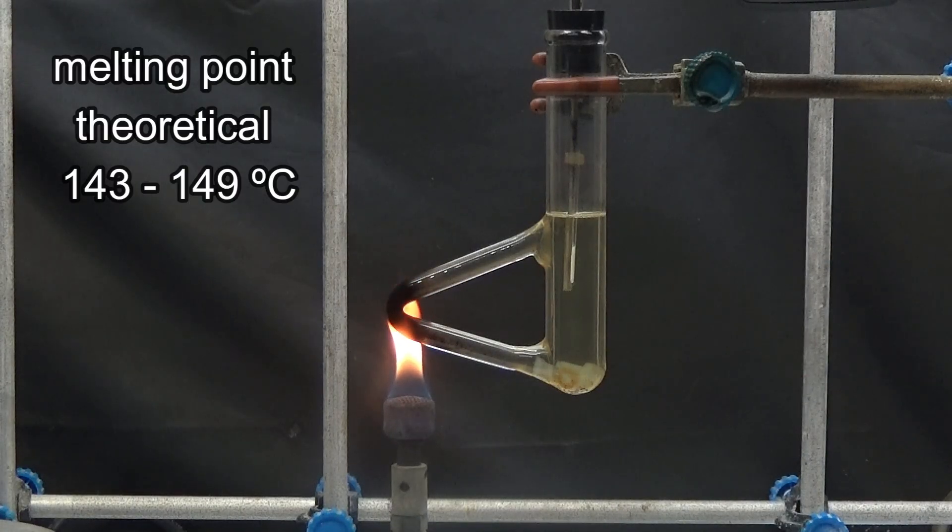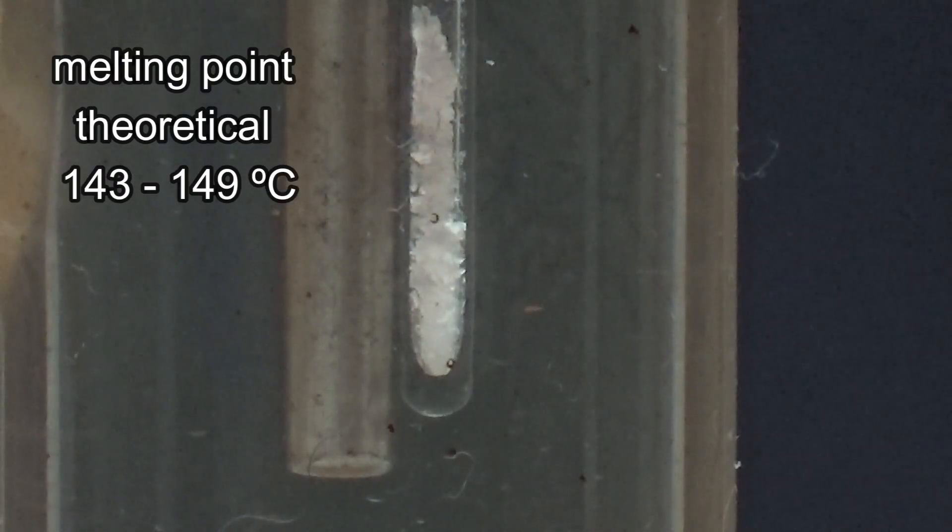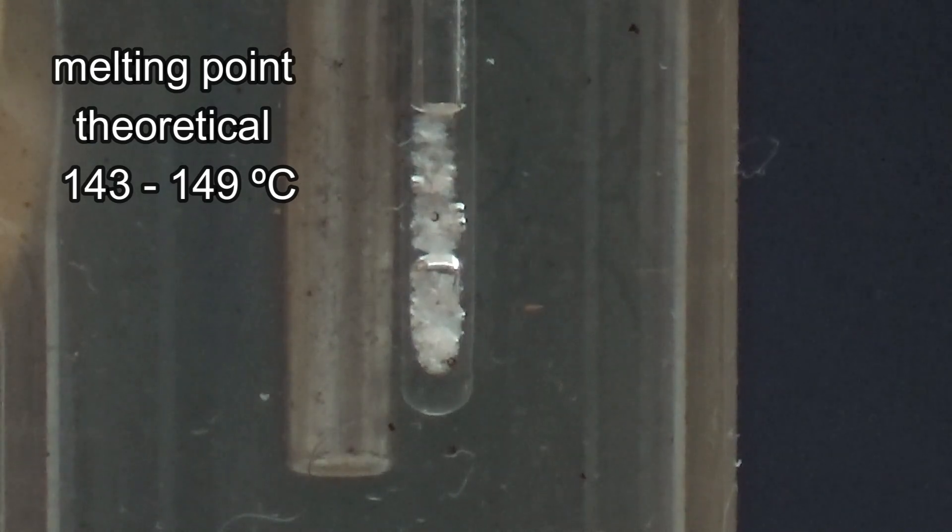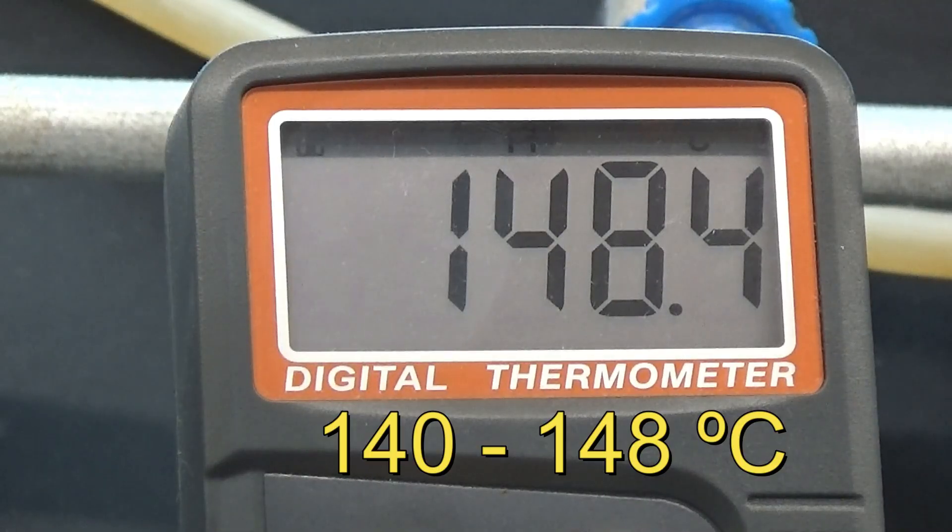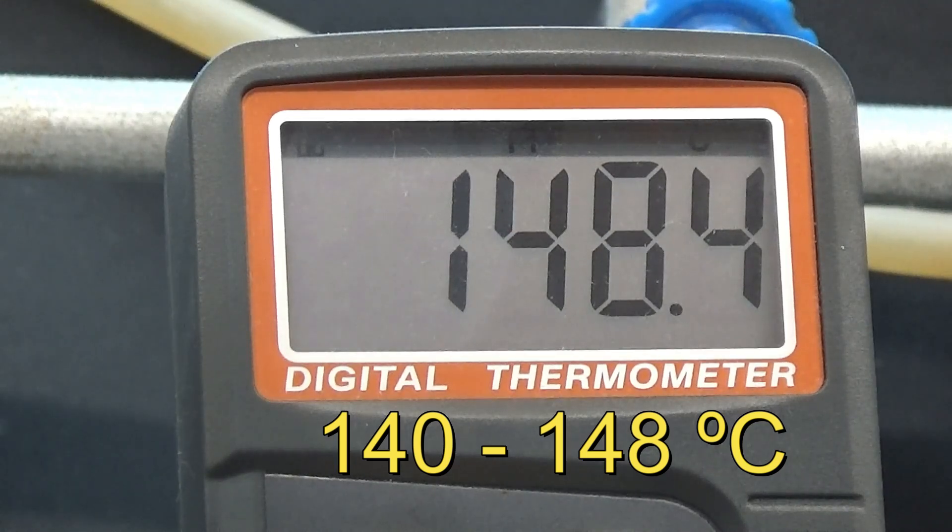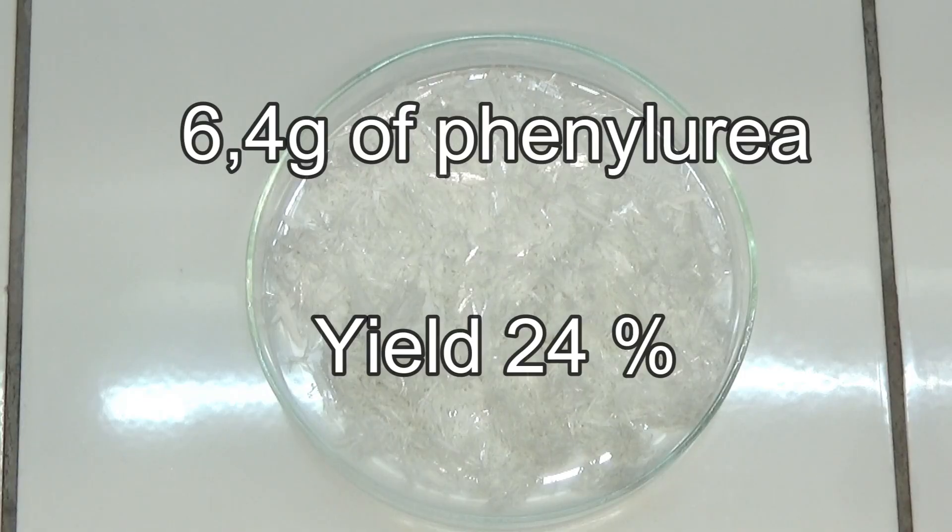Our objective is to determine the melting point, which must be within the range of 143 and 149 degrees. In our test, a value of 140 to 148 degrees was obtained, which was a fairly pure product. A yield of 24% was achieved for 6.4 grams of phenylurea in relation to aniline.